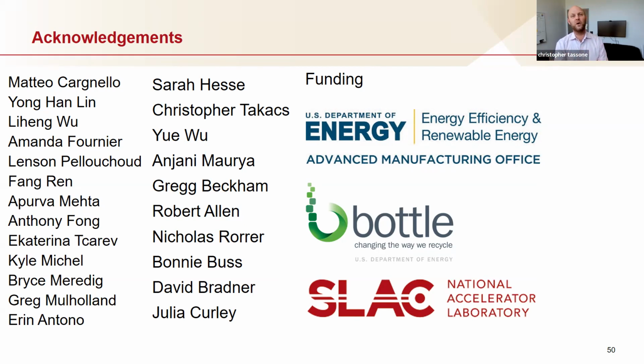And it also is insanely labor intensive, right? The way that we tried to mitigate this was the program XRSD kit, which is basically just a SAXS fitting program. Our initial thought was we built a standalone program. As you fit data, there's an ML algorithm learning in the background, so it's going to start to get really good for each client. They will have their own algorithm on self-similar data, and it'll predict everything.